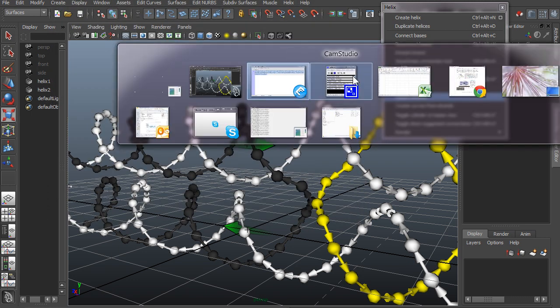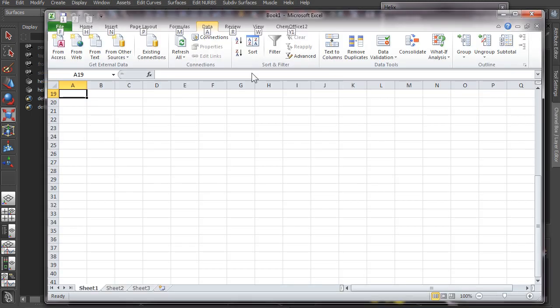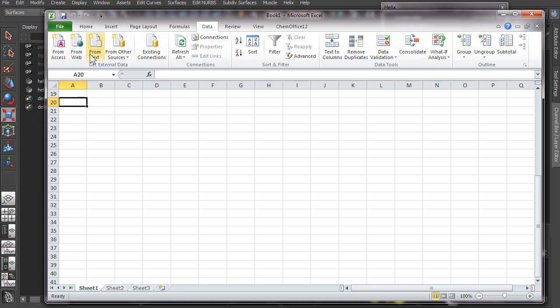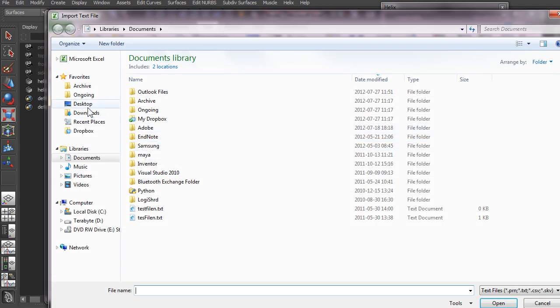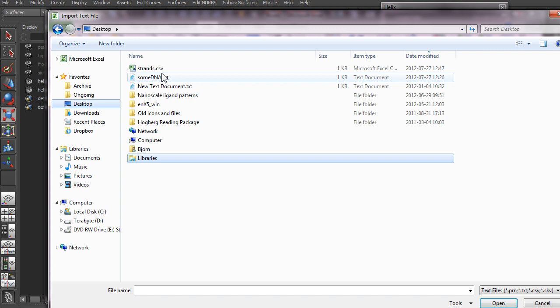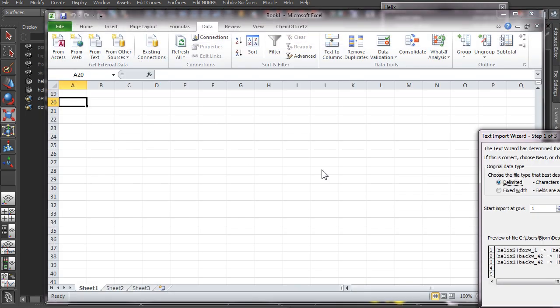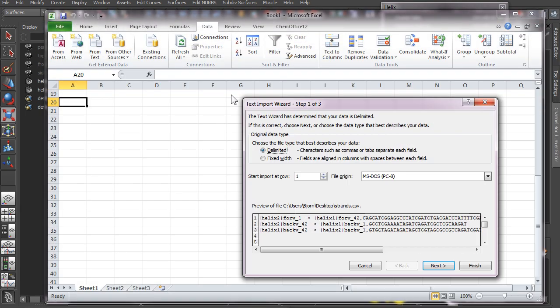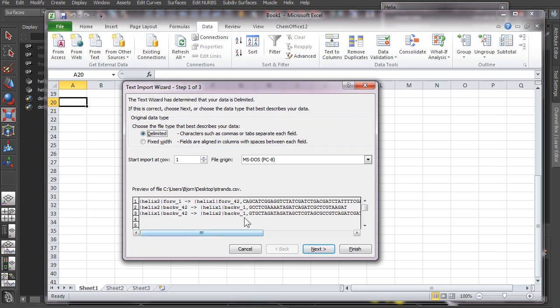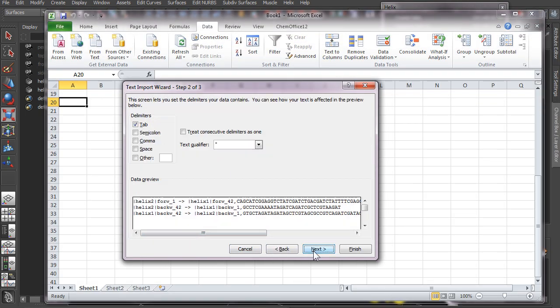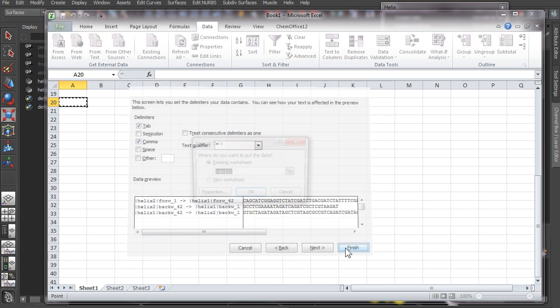And then let's go to Excel. And here in the data menu you take from text. Then it's delimited, comma, finish.